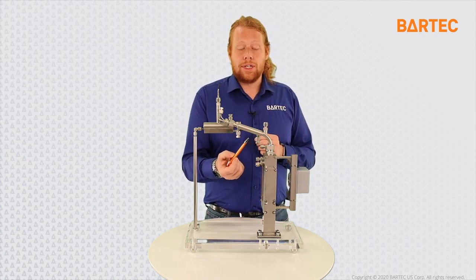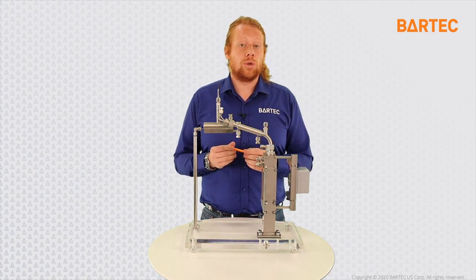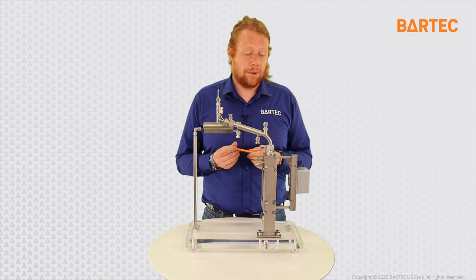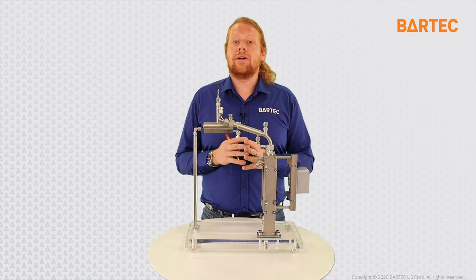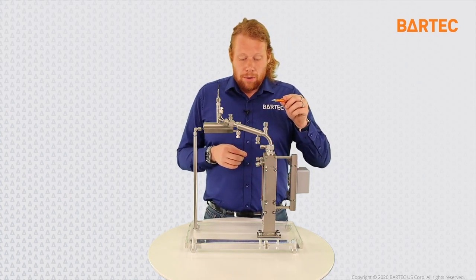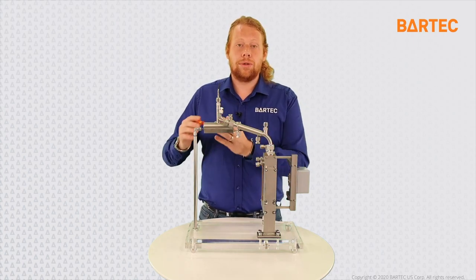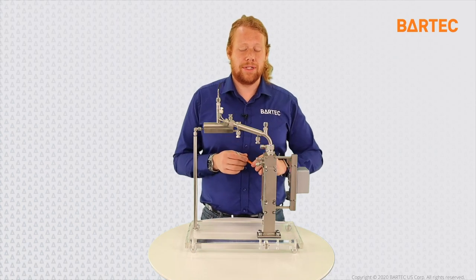As the liquid exits the condenser, the IBP detector will look for the first drop of liquid, giving a very accurate measurement of the initial boiling point. As the cycle continues, the receiving flask fills up and is continuously monitored by the camera. We therefore have a very good measurement of the amount of sample that is being recovered, and depending on how the calculation is made afterwards, we can deduce the evaporated content as well. Once all of this is done, the remaining sample is purged out using nitrogen, and we can start the cleaning process before we load the next sample for the next analysis. With all this said, this is a typical flow path of the sample as it goes through the measurement cell.